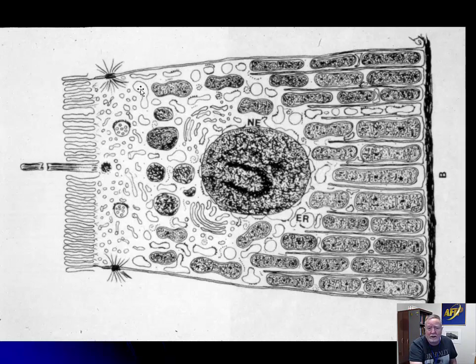The mitochondria are here at the base in this cell. The surface substructures of the membranes look pretty good. Cilium looks good. The microvilli. All we have is this little dilation here. The cell might swell a little bit, bulging into its neighbors if it wasn't locked so hard in place. But we will see that a little later on.